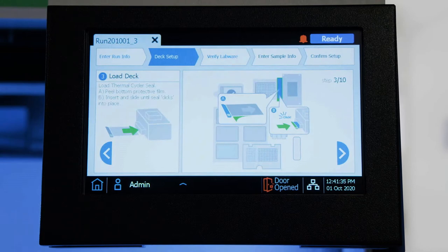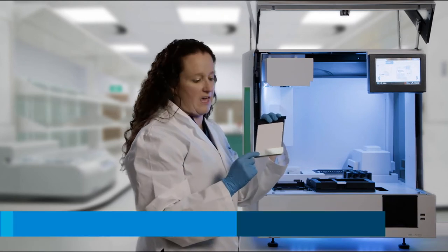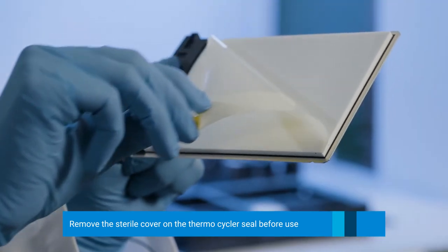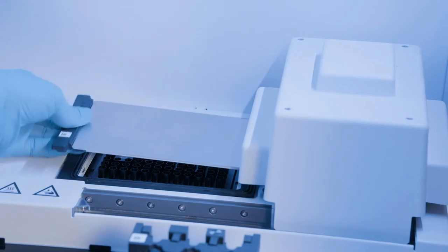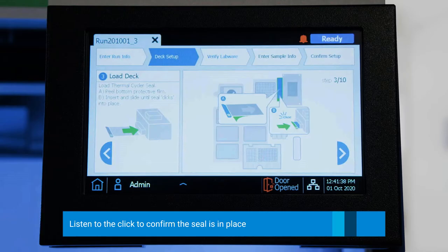We are going to add the thermal cycler seal. It is also in the consumables box and comes with a sterile cover. The first thing you need to do is remove the sterile cover, and then insert this into the back right of the Magnus in the thermal cycler until it clicks. We will continue on.